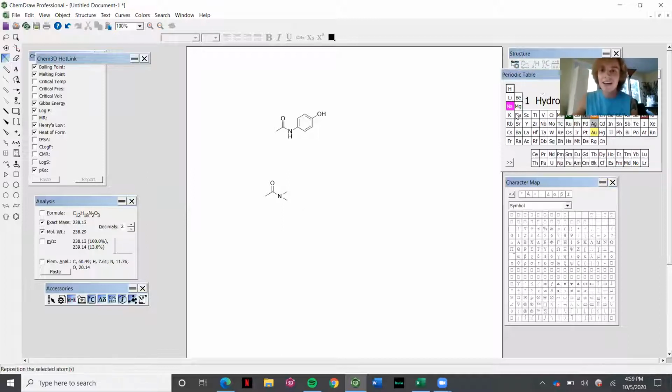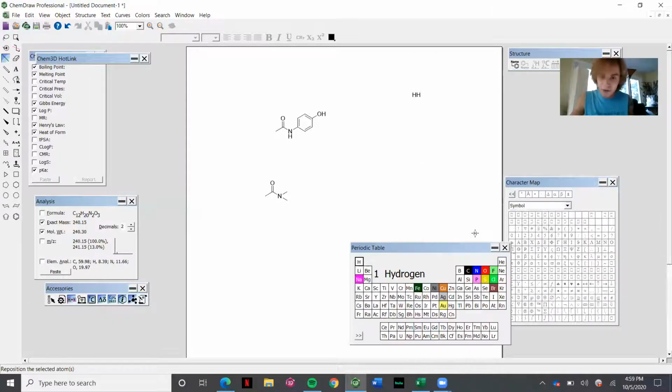Yes, we know this. And as a reminder, I'll just demonstrate right now using ChemDraw, because ChemDraw likes to point out all these little tidbits. We have HONC, H-O-N-C, the 4 most important elements to organic chemistry. And when I click on hydrogen and display it in ChemDraw, it automatically shows up as HH, 2 hydrogens. That's weird, right? Why wouldn't it just show up as a singular hydrogen atom? And same with oxygen, it showed up as an H2O.